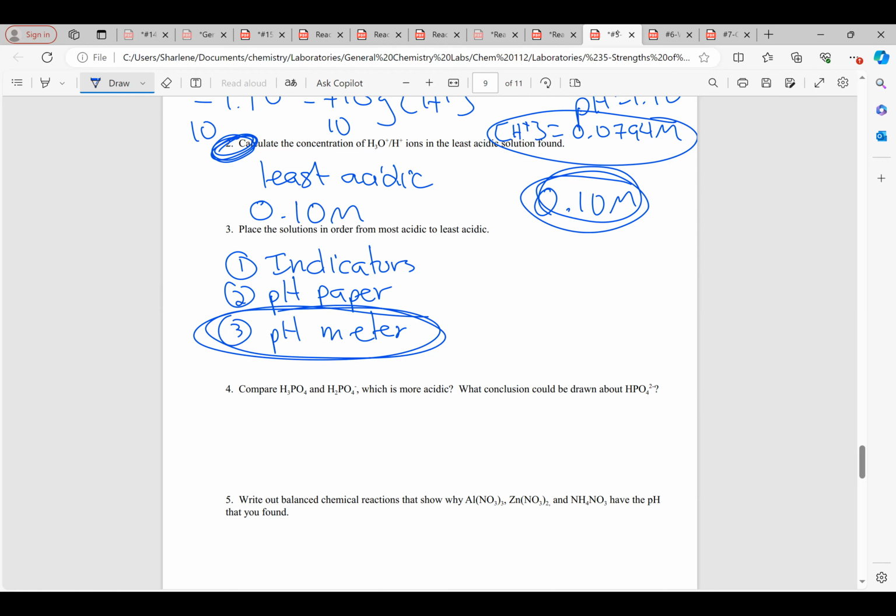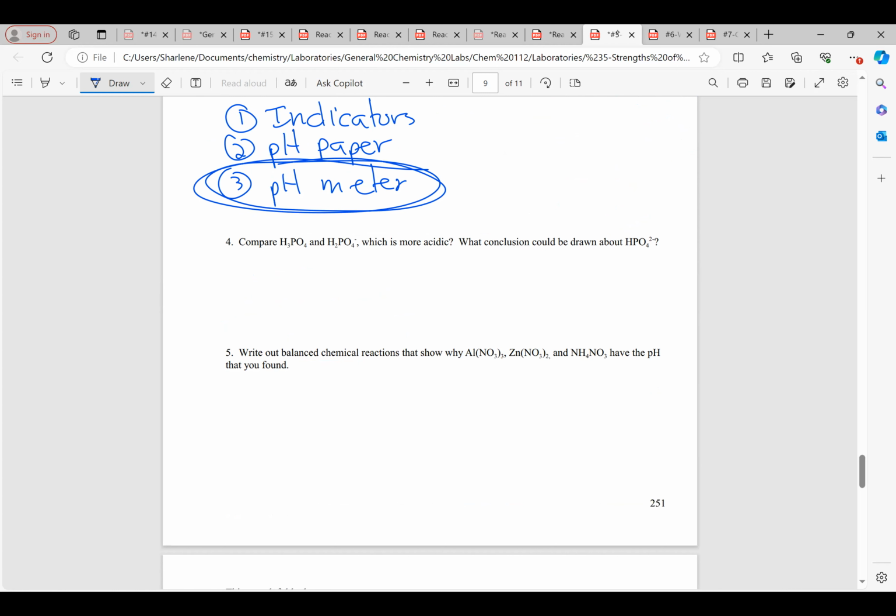And then we're going to play with it, or it's called standardizing it, until we have exactly the pHs that we're supposed to get. Okay, well, that begs the question, well, what if I made the solution wrong in the stockroom for you? We're actually going to test that. Okay, so that's the beauty. That's how we're going to start Thursday. But some of you got these numbers already.